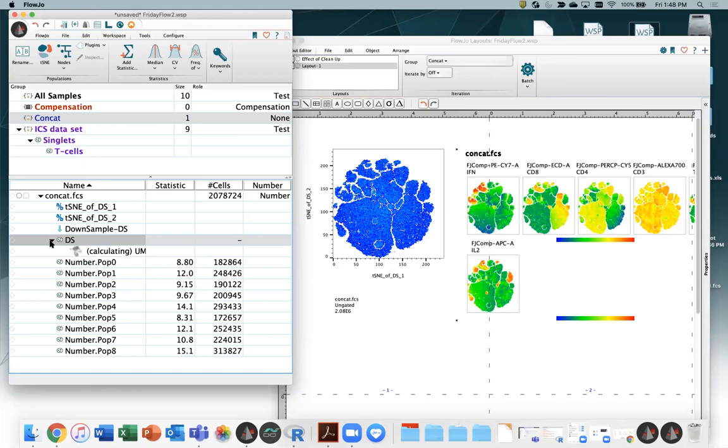Anyway, so we'll take, sorry, mid-thought, the downsampled population, and we'll run FlowSOM on it, look at all the results, Phenograph on it, look at all the results, and XShift on it, and look at all the results and compare. And then just show how to batch out some of those outcomes on the various samples 0 through 8 that we've added to this data set.